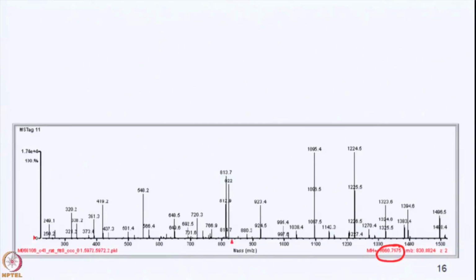But there also seems to be a bunch of peaks that are close together. If you look close, you can see that these peaks are separated by 18. So this is 18, 18, 18. That one's 28.